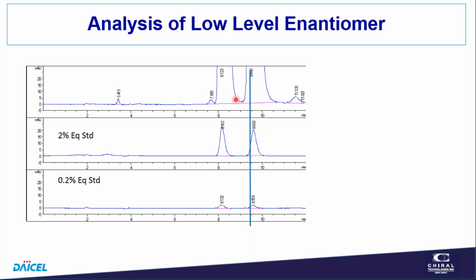So you just extrapolate the exponential decay from this peak into here, and you think, well, in this region here, we get a little bit of this contribution of this peak to the area of this peak. At say 2%, it's probably not significant. It may be measurable, but it's not very large. But what about at 0.1% or 0.2% or 0.05%? You can see that could be an appreciable area, and we would have biased the area high.